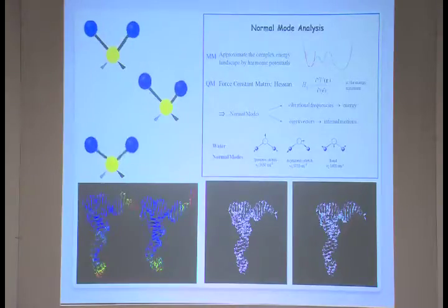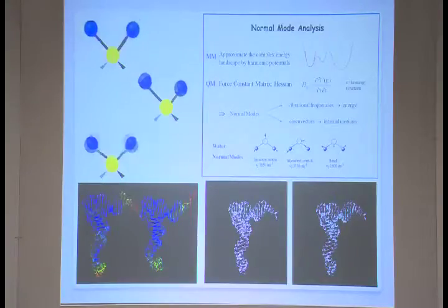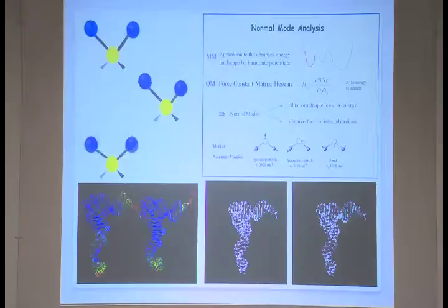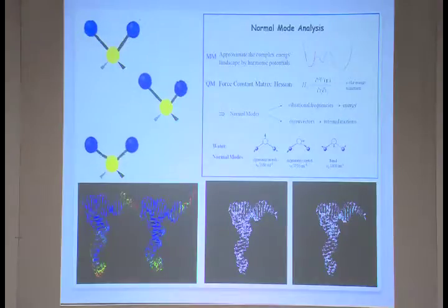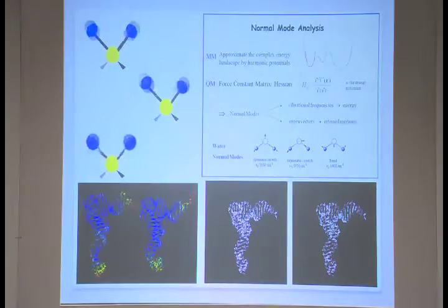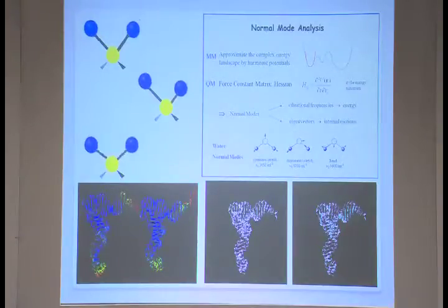Definitely it cannot, but very interestingly, for a big molecule, when you compute normal modes, the lowest normal modes shows some correlation with a large motion of these macromolecules. So that really inspired them to use this method as a fitting method.